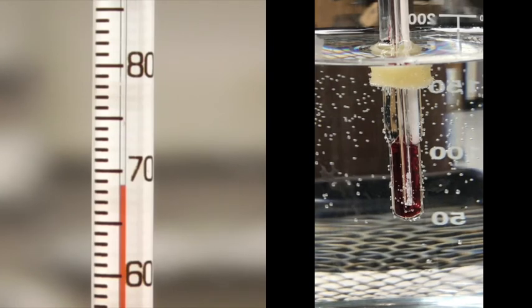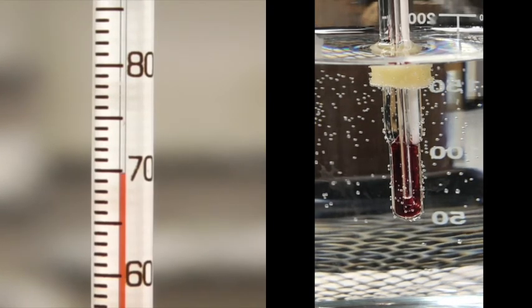Well, looks like things are starting to melt in there. And still working on it. Looks like they're all gone. That's a pretty good melt. Nice. So we got a much better range that time just by slowing that temperature down. So there you go. That's the biphenyl. So now we need to go do our unknowns.